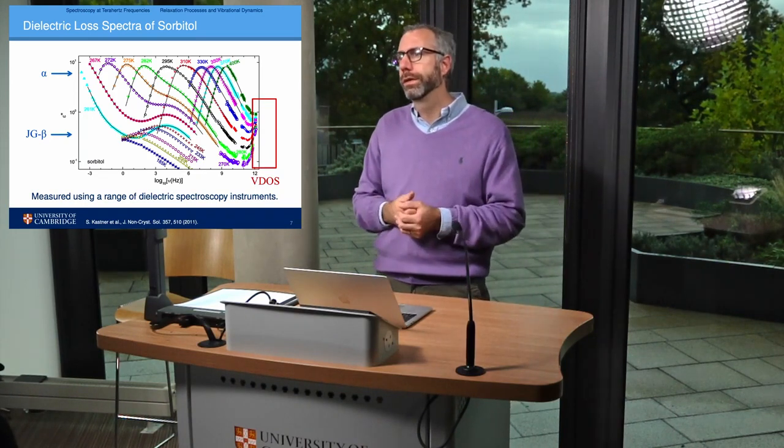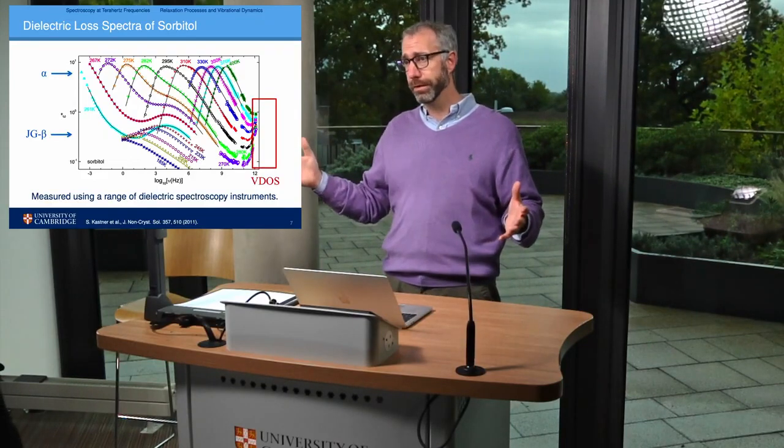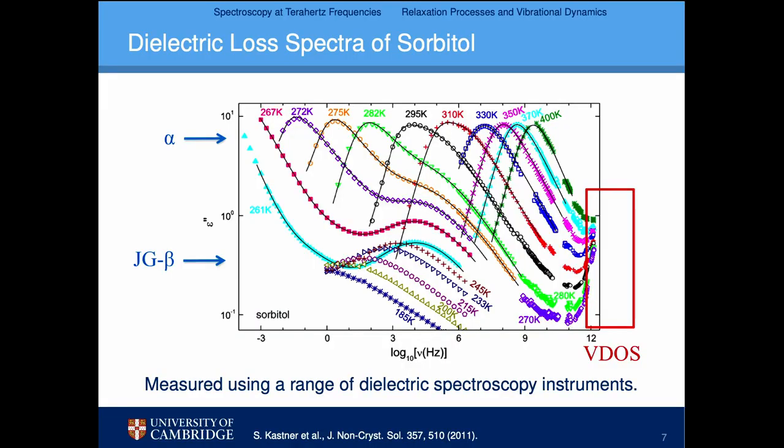And the other characteristic that is very prominent is that the spectral features shift a tremendous amount in frequency as the temperature of the system is changed. And we transform the sample during cooling, say, from a supercooled liquid at 400 Kelvin into a glass at temperatures well below the glass transition, which for this system here is 268 Kelvin. And also highlighted here in red on the slide, we can see the spectral region where the terahertz spectroscopy method can complement now these dielectric spectroscopy measurements.